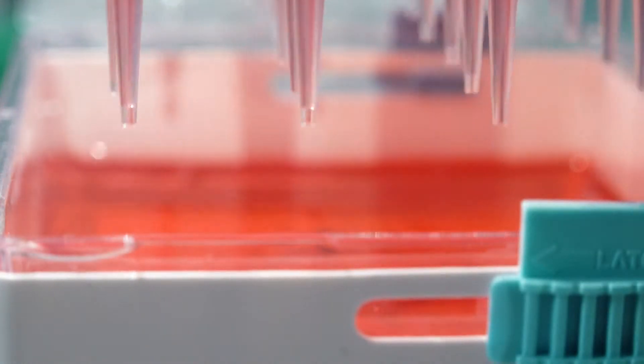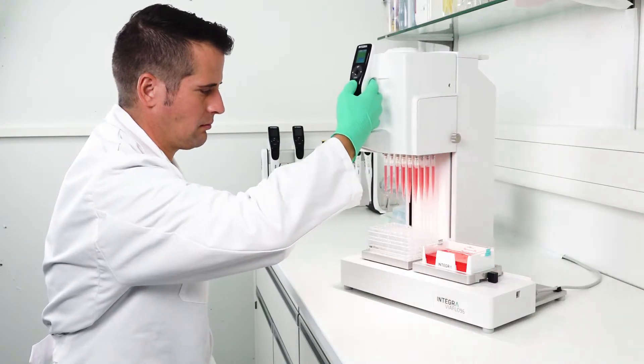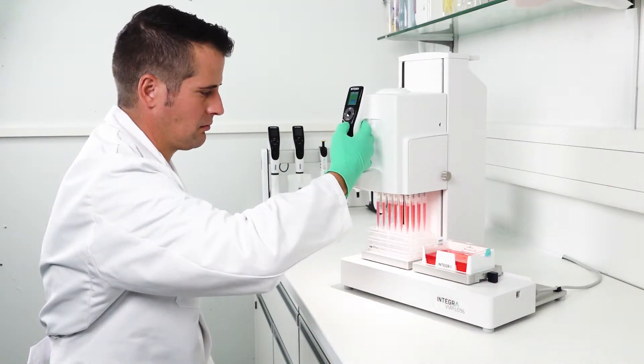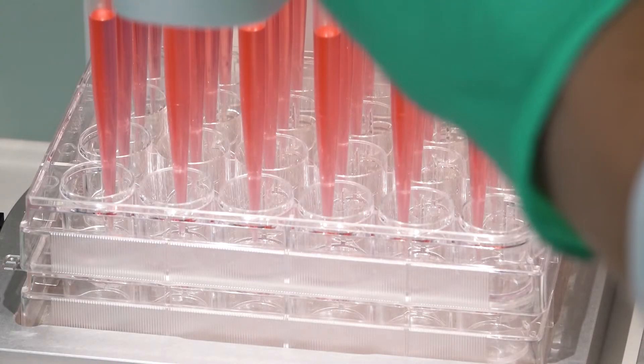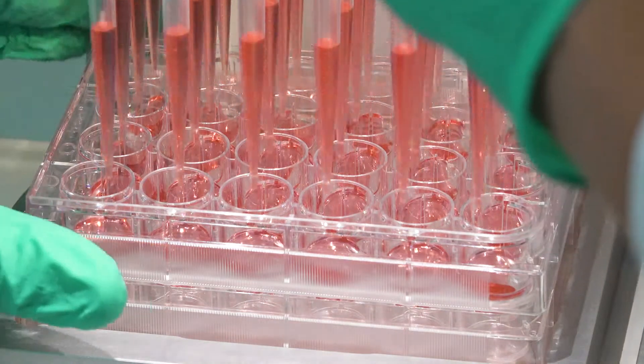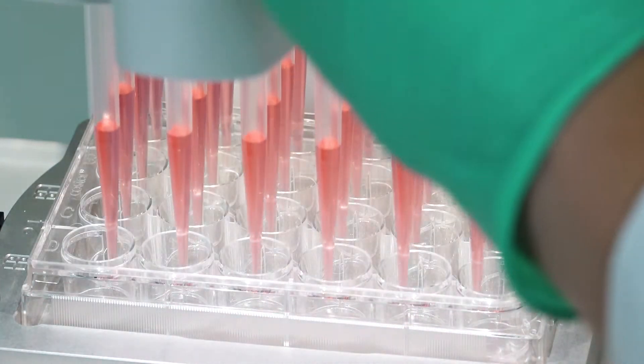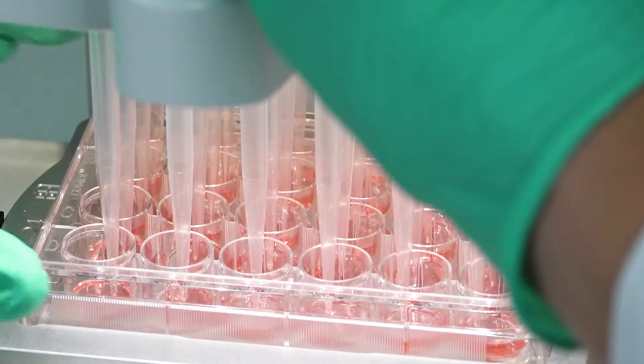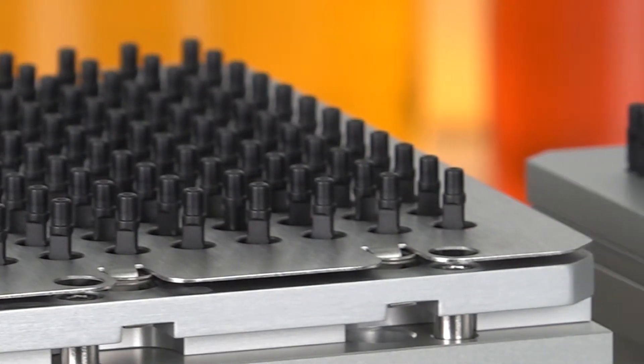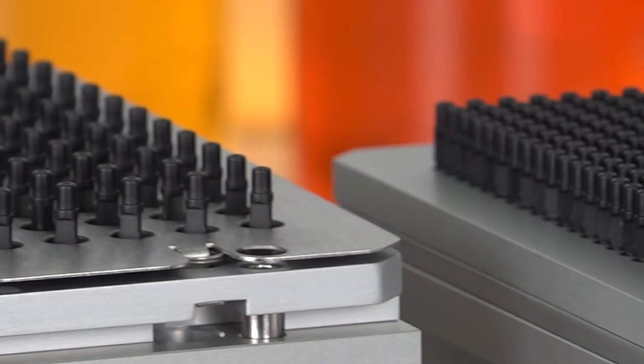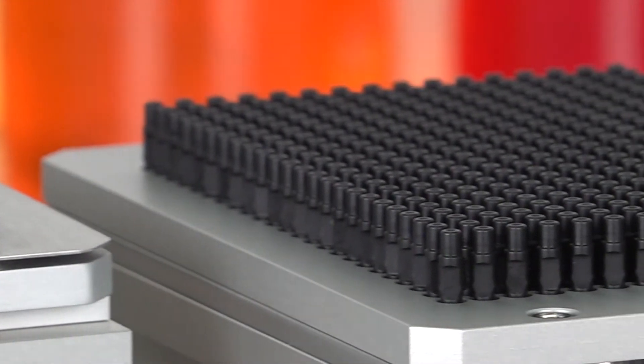Nearly all 24-well plates can be accessed using either a ViaFlow 96 or ViaFlow 384, pipetting up to 1250 microliters in one or multiple dispenses. This pipetting head adds even more possibilities to the existing range of 96 and 384 channel heads.